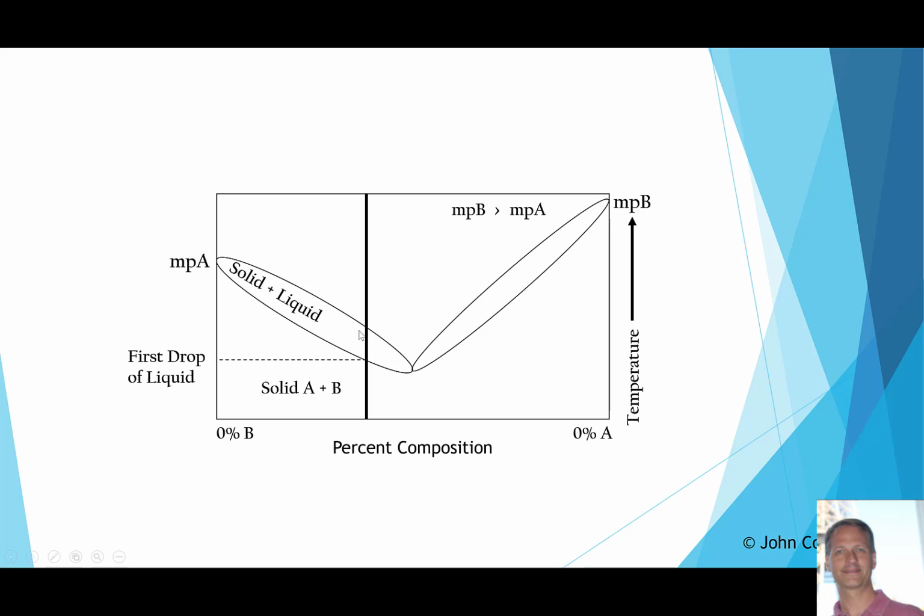Now, in the middle here, we have a mixture of a solid and a liquid. We're undergoing a phase transition here, right? And because we're continuing to heat, we see a little bit of a lag here. But we see the temperature going up, and at some point, we're going to witness the last little bit of that solid. When that last little piece of solid disappears, it kind of looks like it's dissolving, but it's melting. We call that complete melting, and that range right there is your melting point range. So this is why we see capillary melting points listed as ranges.